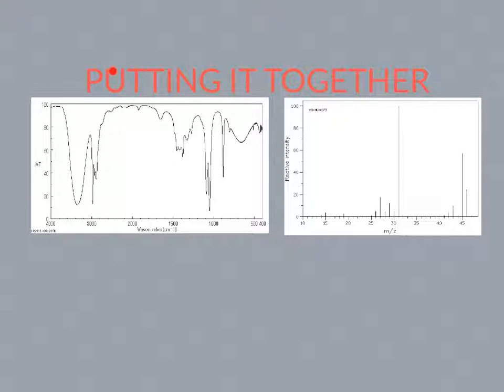Next we'll go to zone 2 in this area, and we can note that we do have some single bonds to carbon and hydrogen, some sp3 bonds. Not much going on in these areas. You will notice some very small peaks, but nothing worth noting.